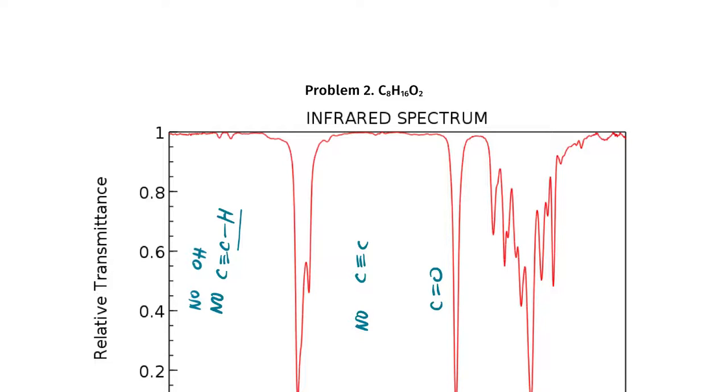But once you move beyond to the right-hand side, to the lower numbers, it becomes less certain. There's a lot of overlap. But we can potentially think of this guy as C single O single C, and the 1100, 1050 to 1200. Okay? And that's it. Don't read too much into IR, especially don't try to read too much in the fingerprint region, which is right over here.